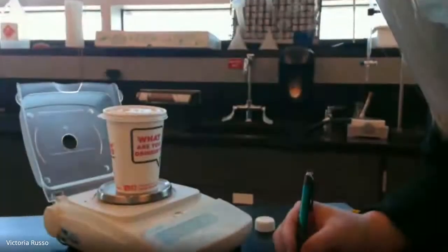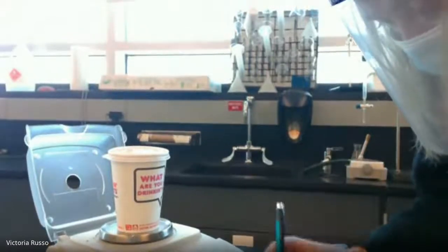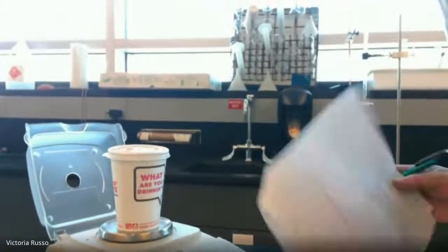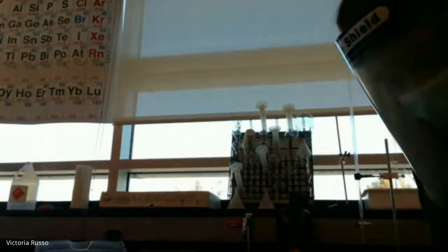So it now weighs, and if I look at what the cup is weighing, it now weighs 52.654 grams. These are all grams. So 52.654, and again, I will send you a picture of the data table. And so to get the mass of HCl used, you're going to subtract those two numbers. So you can do that yourself, guys. To get the mass of HCl used in the data table, you are going to subtract 52.65 minus 12.332. I don't feel like getting a calculator. I'll do that later.